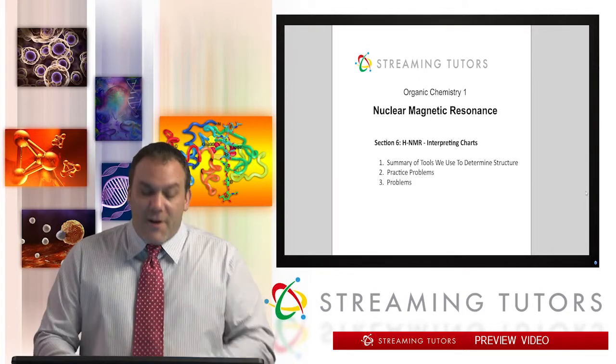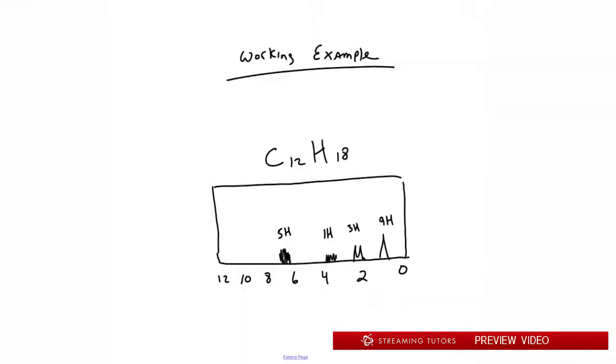Okay, so let's get started. So here's our working example. It's pretty simple. It's 12 carbons. Here's our formula, and this is the chart that we're going to interpret. All right. Now, there's no IR. Sometimes they give you IR data. In this case, there's no IR needed, and what we have is what we need in order to come up with the answer. So again, I know you right now want to try, but don't.